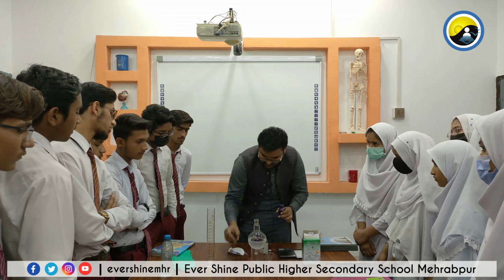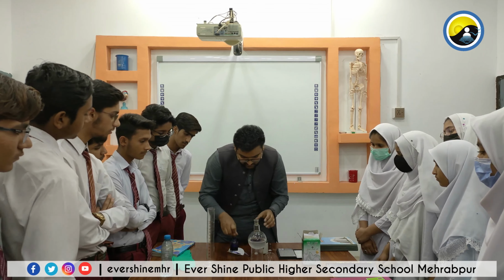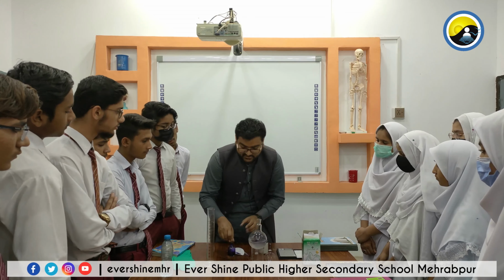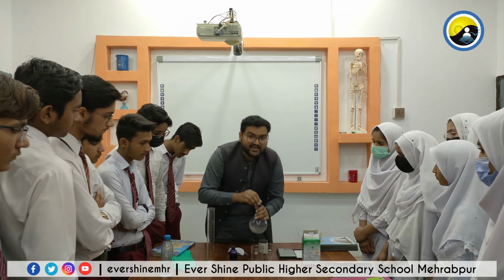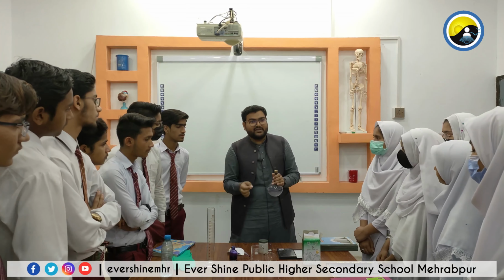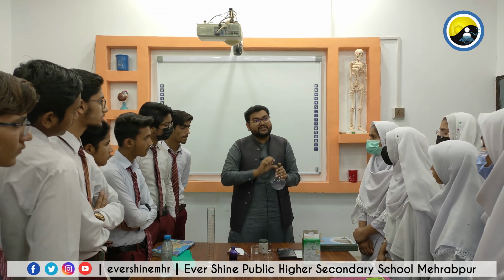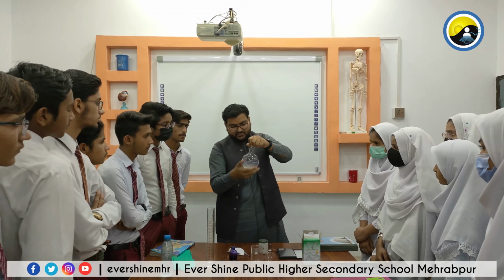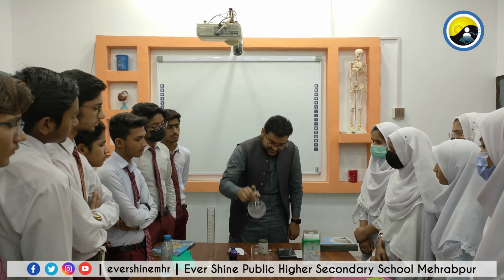Sir, may I ask a question? Yes, sure. Why are we using methylene blue? Methylene blue is the indicator we mostly use for redox reactions because when oxidation is occurring, its color is blue, and when reduction is happening, it is colorless. So it identifies when reduction is happening and when oxidation is happening. So shake it a little bit and place it.